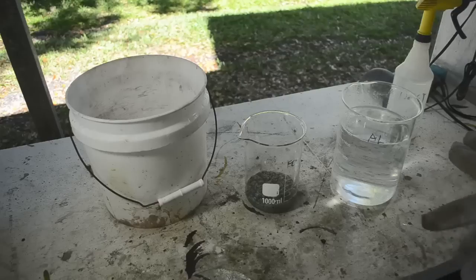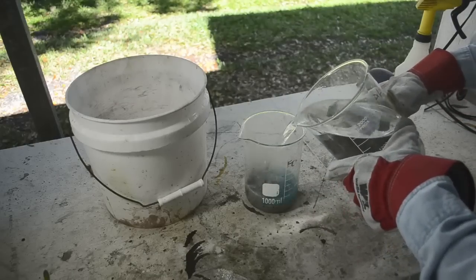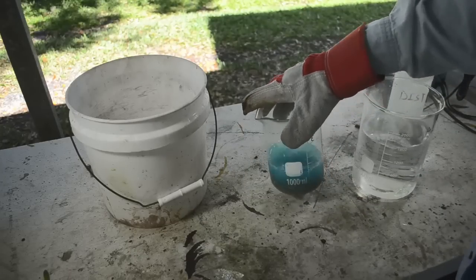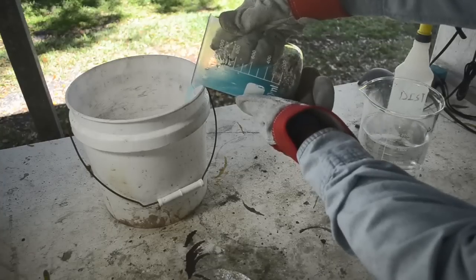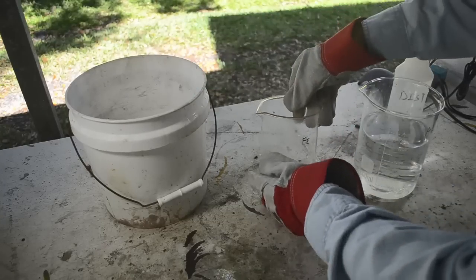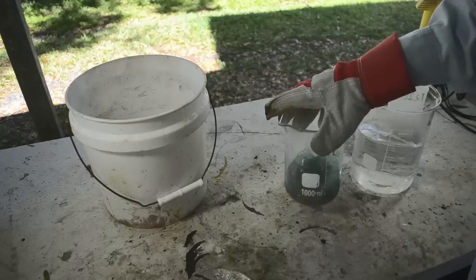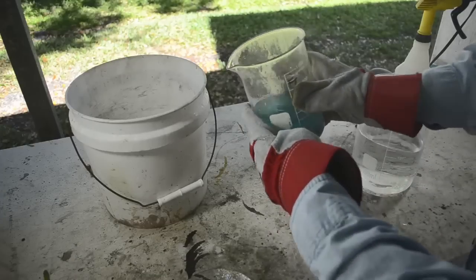and see if we can clean it up, get rid of any trace of the blue fluid in there, the blue copper nitrate. We'll give it some washes here. Let that settle and pour it off. And I'll just keep repeating this until I don't see any more blue copper nitrate coming off of it, and then probably do it one or two more times just to make sure I've got the vast bulk of it out. Because it is tenacious. It takes a lot of rinsing to get rid of all that copper nitrate in there. Takes a whole lot of rinsing.